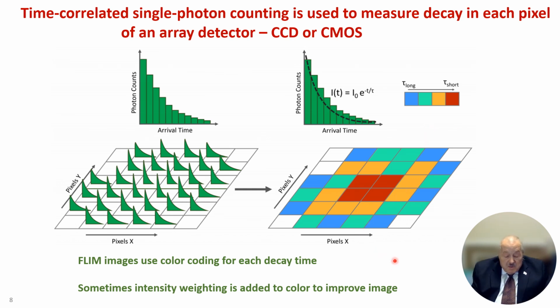Sometimes these images can get confused because many people add intensity weighting to improve the appearance of the color image, and that's something that confuses me sometimes.